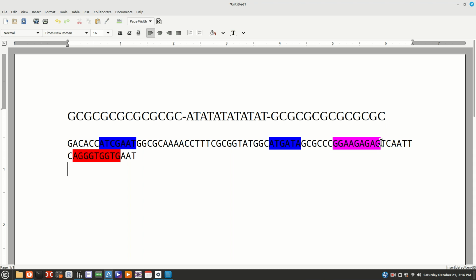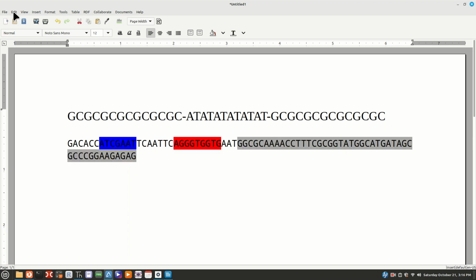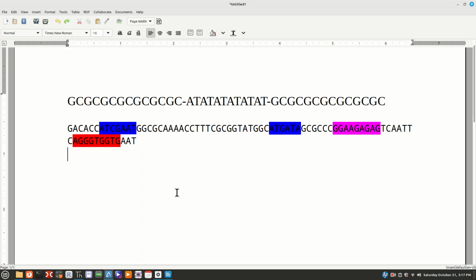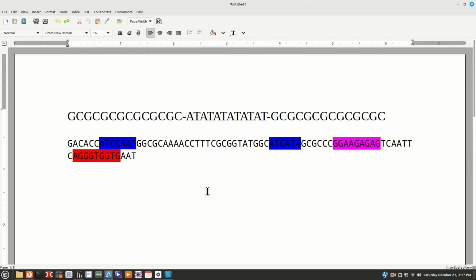All right, these definitions are not that strong, but if you were going to find the promoter, I would say it's right here. It's this gray area that I have said, and our high AT region is centered around this piece, which could be our TATA box. Not certain, but it could be. And then we have GC regions on either side of it. So that's what we're looking for here.